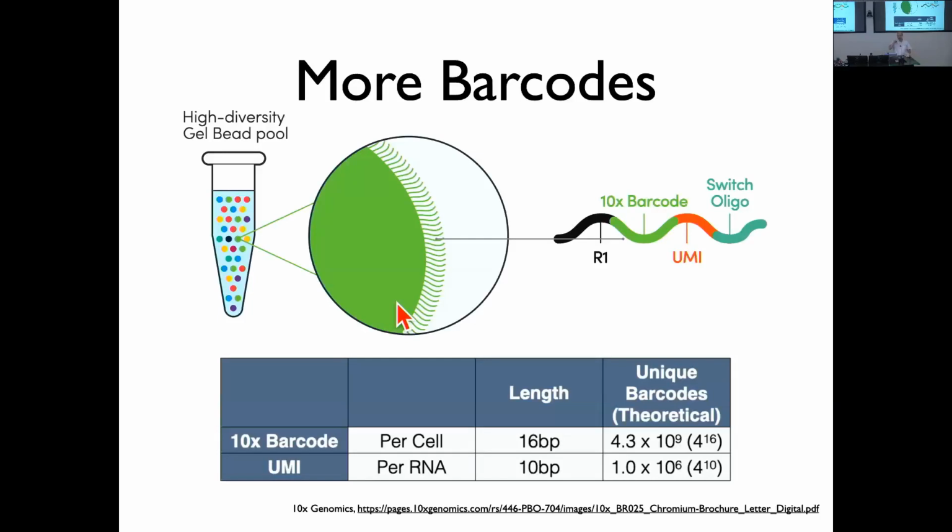And so in the A beaker, A's get added to all the oligos on all the beads. So you let that reaction go, then you take all your beads, and assuming you just want it random, there are different ways you could do it, you put them all together, you mix them up, you divide it into 4 equal parts, and in one beaker you put in the ATP analog, in one beaker the GTP analog, in one beaker the CTP analog, and in one beaker the TTP analog.